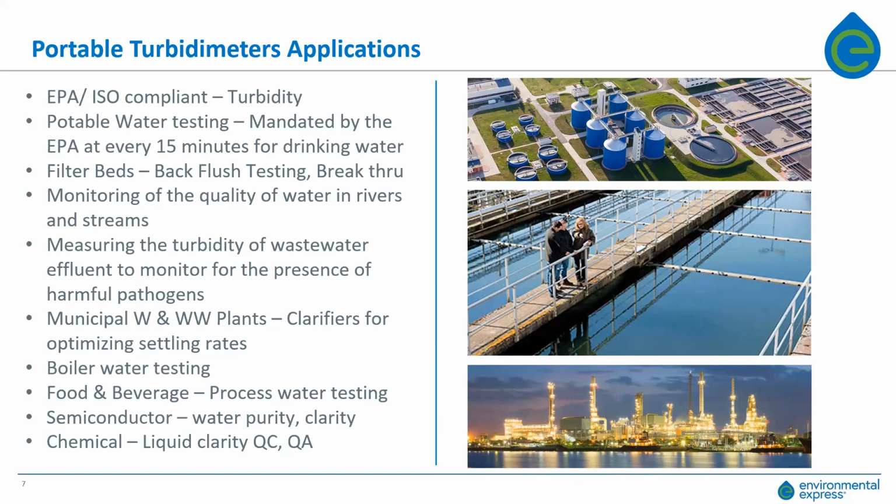Another application, as I mentioned, was for municipal water and wastewater plants, clarifiers for optimizing those settling rates. Clarifiers are a key piece of equipment in a drinking water plant as well as a wastewater plant. Another specific application is for boiler water testing. Boiler water is a pressurized closed system that its biggest enemy would be oxidation or rust.